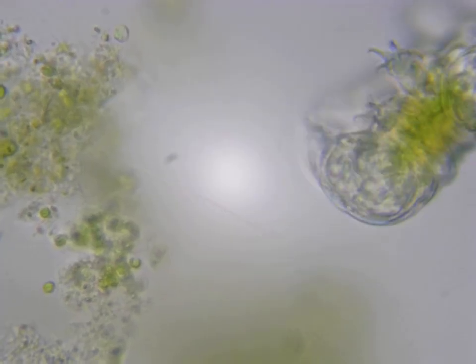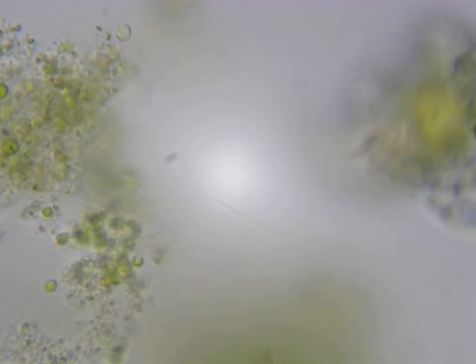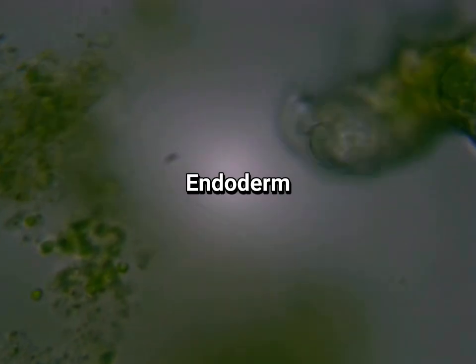Tardigrades don't have a true circulatory system, but they rely on a fluid-filled body cavity for the transport of nutrients and gases. And then they have an inner layer called the endoderm, and this contains their internal organs, including a simple digestive system and a reproductive system.